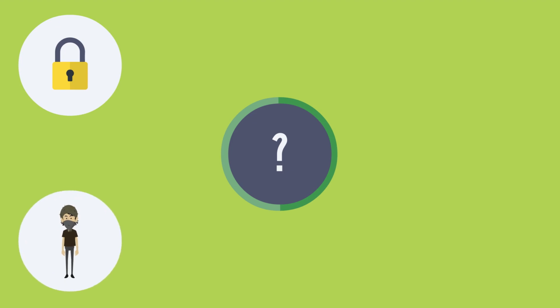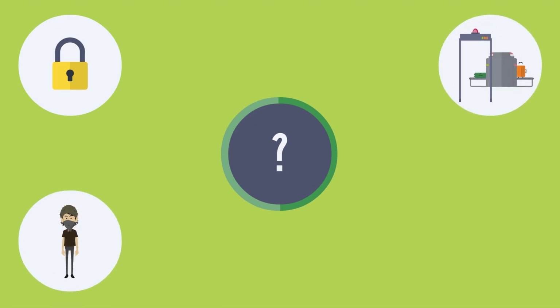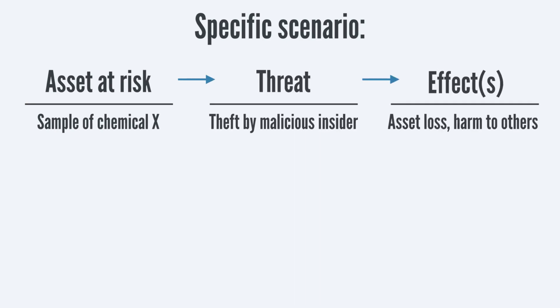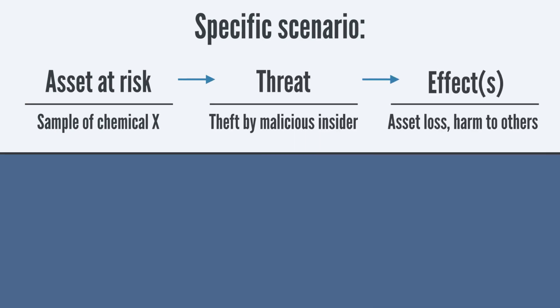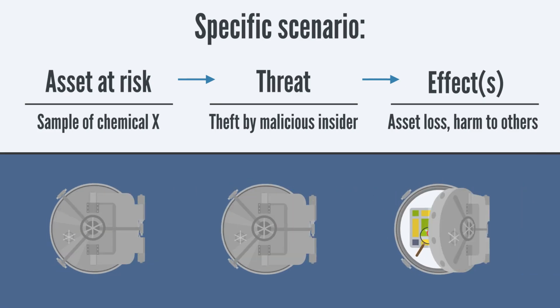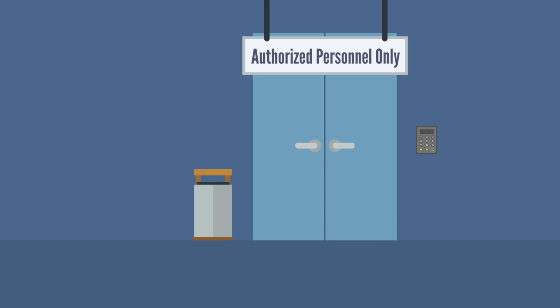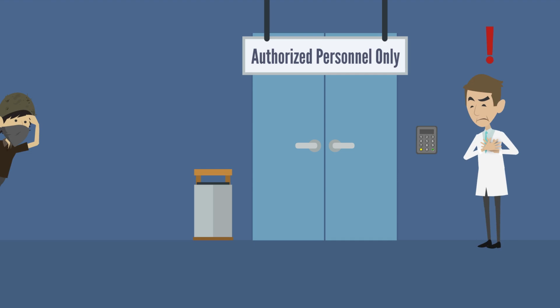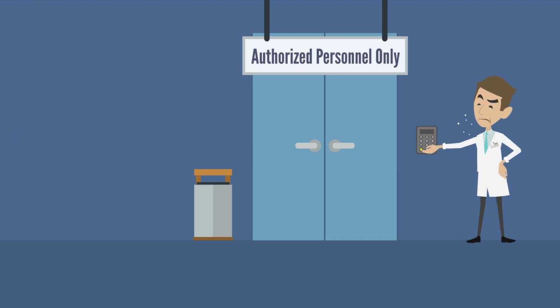How do you screen and train your authorized personnel, and what do they need to know? Can unauthorized personnel, such as a cleaning crew or other limited employees, gain access to resources they shouldn't? Scope out these potential insider threats, along with likely outsider threats, and restrict access to the inventory system, physical assets, and other need-to-know information, such as the location of any chemicals of concern, accordingly. Be sure to label areas limited to authorized personnel clearly, and train authorized personnel to recognize and challenge unfamiliar individuals in restricted areas.